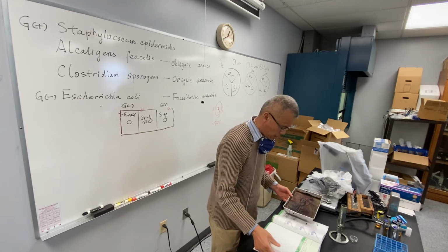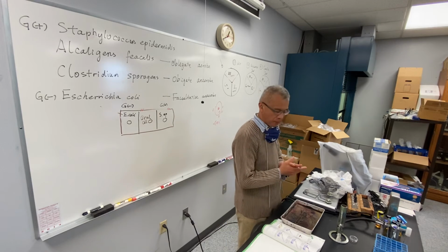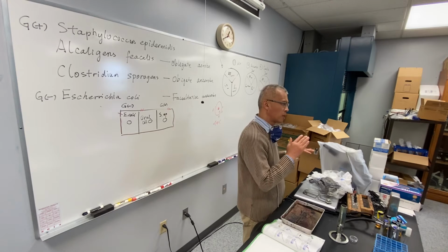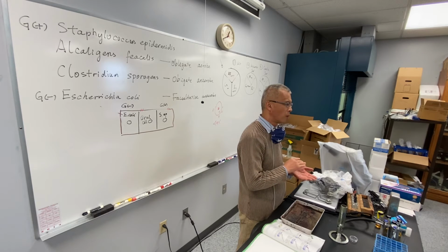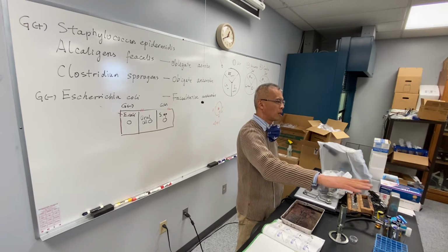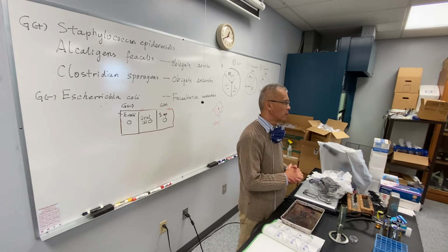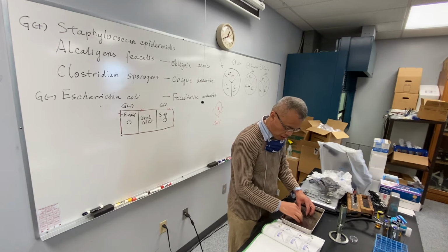The timing, based on my advice, is this: you have the slide ready to add alcohol, and you count about 10 seconds. You count 1 through 10, but when you count number 7 or 8, you go back to your bench and start washing out. Then eventually it will be around 10 seconds, right? And wash out the alcohol.